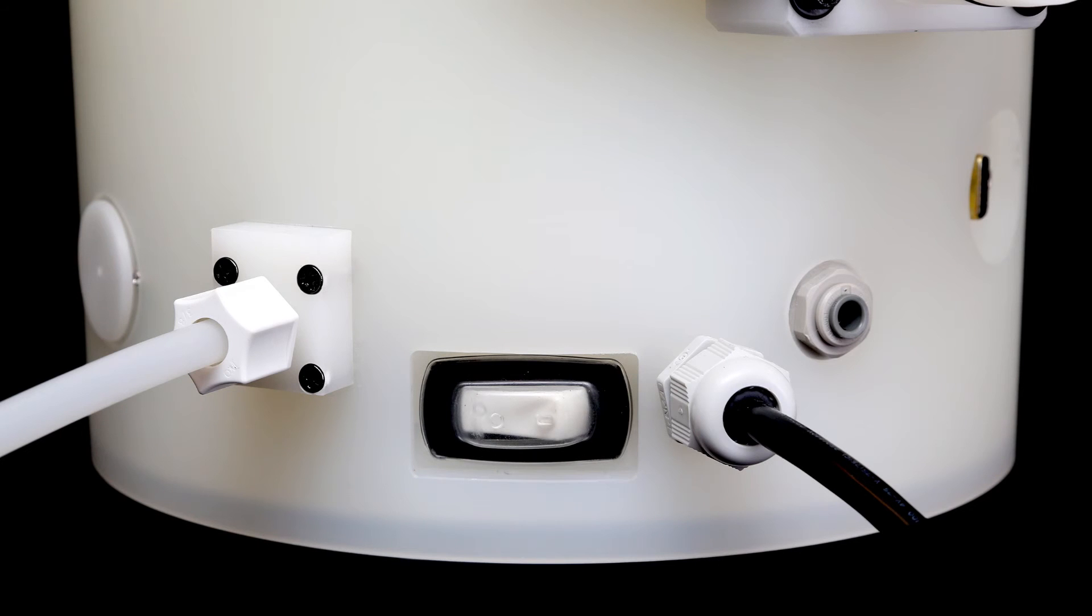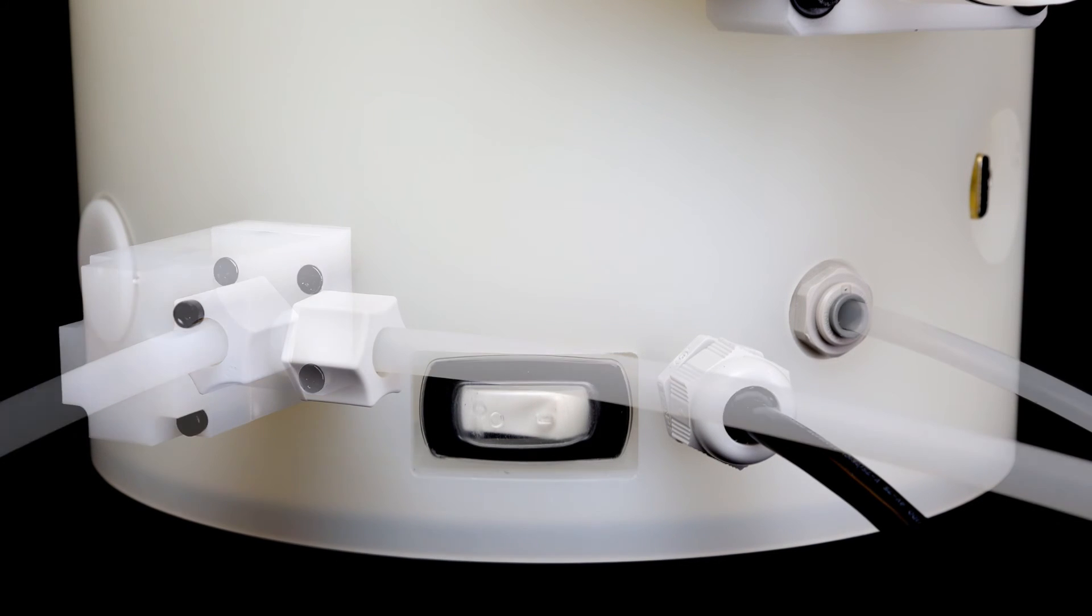Every GBS system can use a standard vacuum valve, with connection of the seal purge supplying clean dry air, nitrogen or argon.